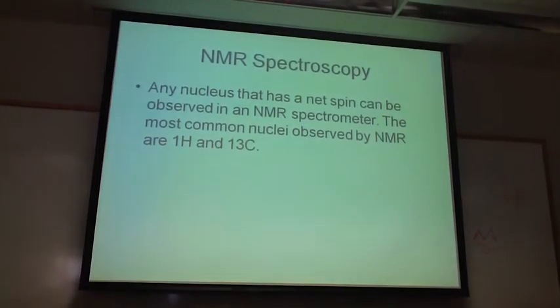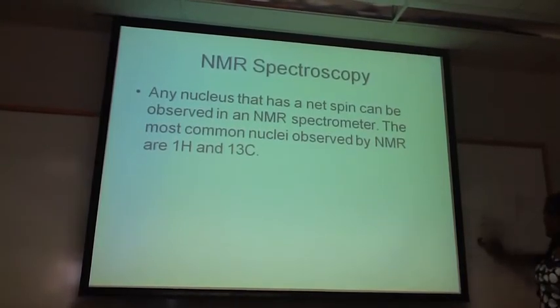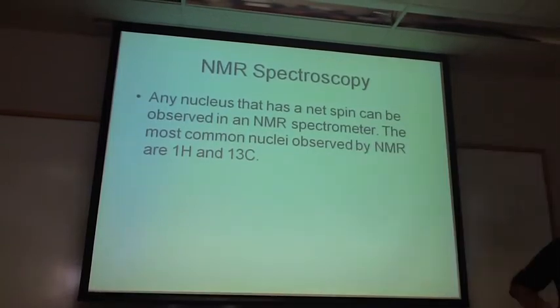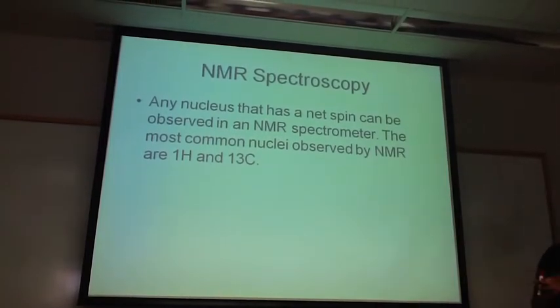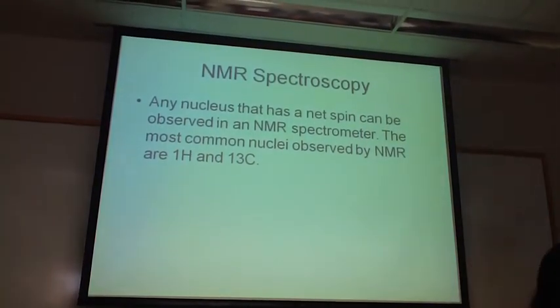So understanding how an NMR works and how signals appear is a little bit tricky. And so lucky for you guys, more important than knowing how everything works is to understand how to read an NMR spectrum. Okay, so I'm going to leave everything a little bit gray and just tell you an idea of how NMR works, and let's read how to do it.